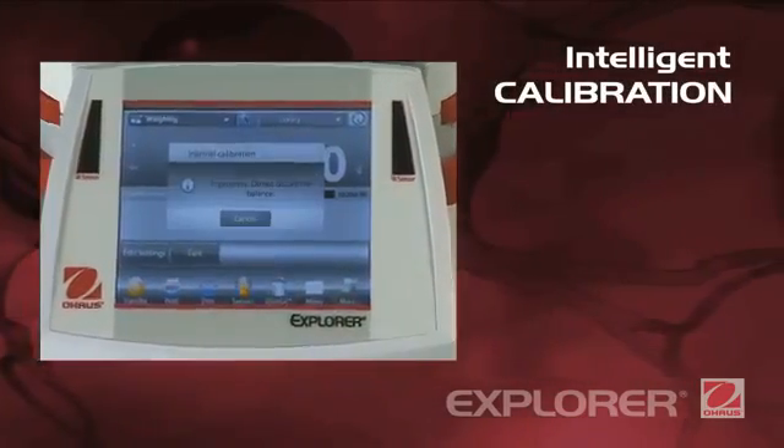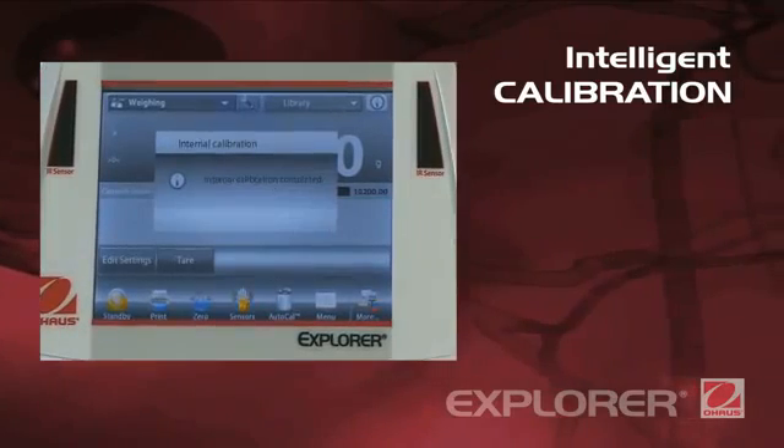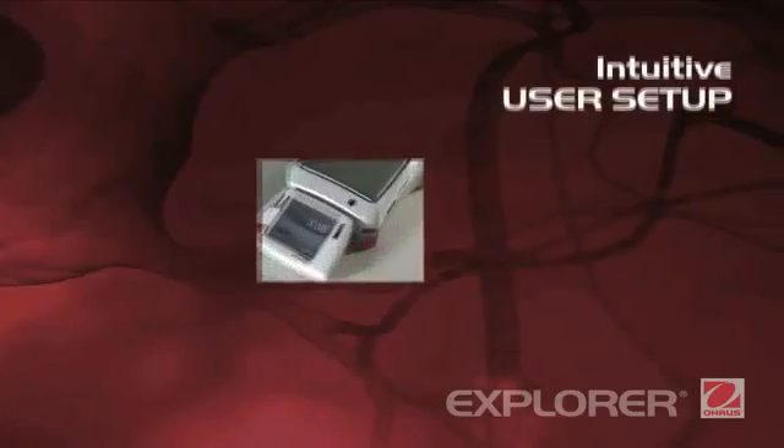Intelligent calibration. AutoCal ensures performance and assists with routine maintenance by automatically calibrating the balance daily. Calibration is made simple and no weights are required.